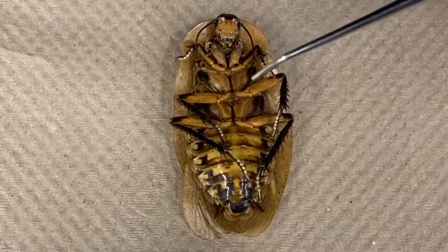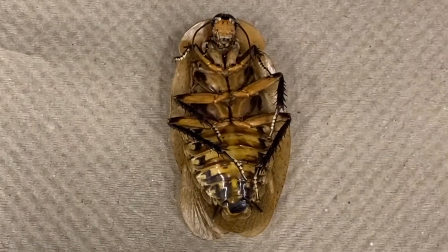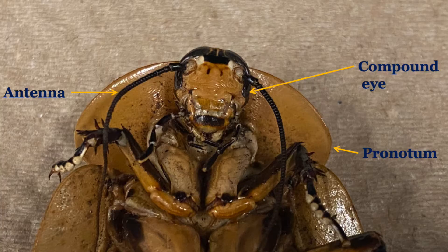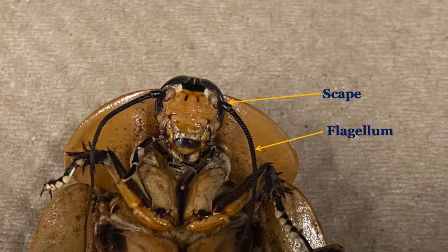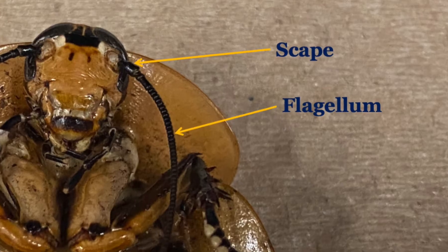There are three pairs of jointed legs on the three segments of the thorax. Taking a closer look at one of the legs, you can see the various distinct parts. Looking at the head, you should be able to identify the antennae, pronotum, and compound eyes. The antennae, consisting of the scape and flagellum, is a sensory organ that cockroaches use to explore the world around them.